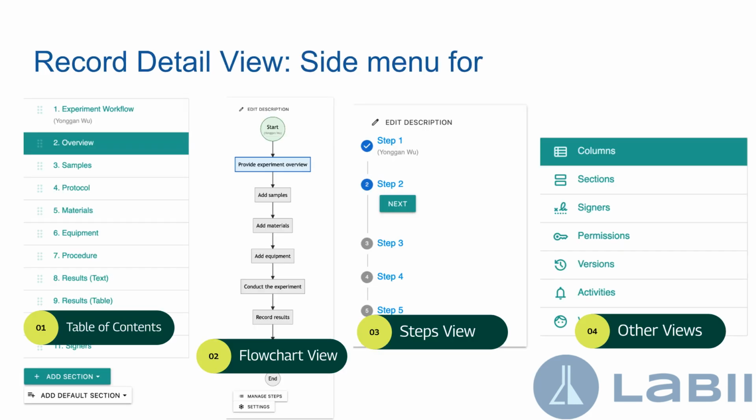The second part of the side menu changes dynamically based on the selected view. In the Table of Contents view, it displays the different sections of the record for easy navigation. In the Flowchart view, it shows the flowchart directly within the side menu. In the Steps view, it lists each step in sequence, allowing you to track progress or workflow. In other views, it provides quick access to columns, sections, audit logs, and additional related information.